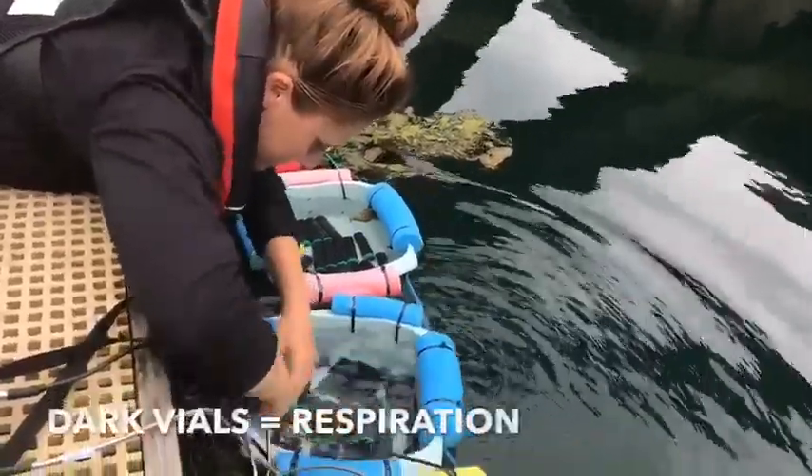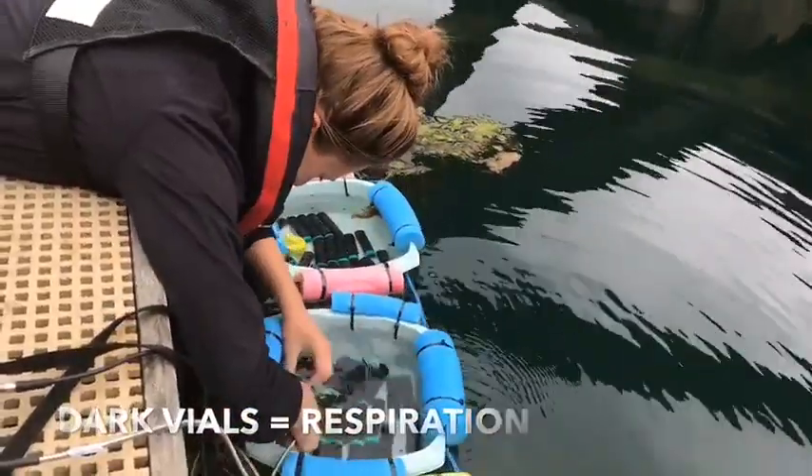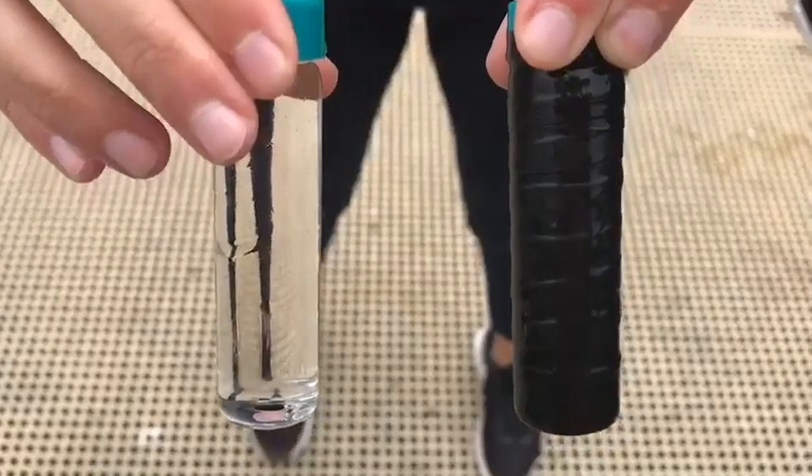In the dark vials, any oxygen consumed is from the microbes consuming any organic matter. In the clear vials, there'll be photosynthesis going on due to the exposure to natural light. By separating those two types of vials, we can try and separate those processes.